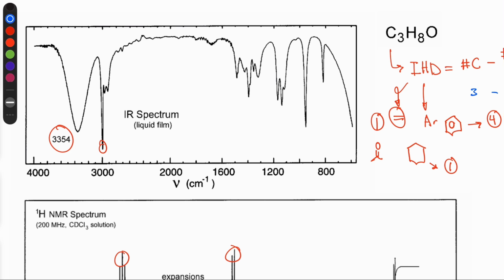So next step, we're going to start with the IR spectrum. We actually have 2 significant signals here. We have others too, but here we call it the fingerprint region, so it's not that informative for us, at least in most cases that we're going to analyze and assess in the future. So these 2 signals that I indicated are very important, and I show them with IMP, but this one has a slightly different shape.